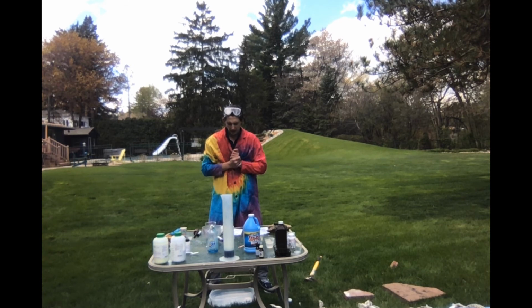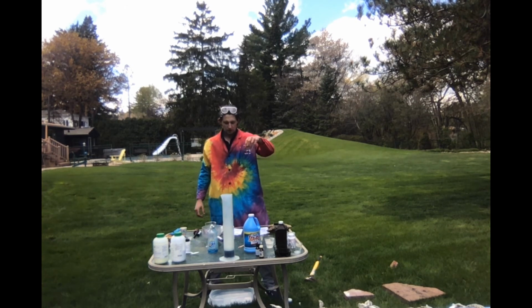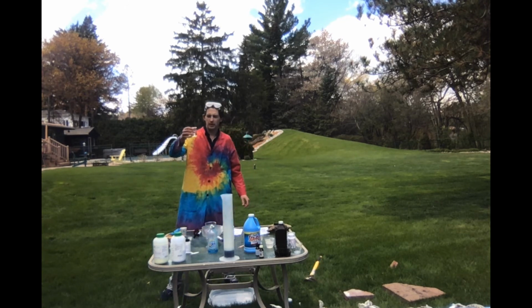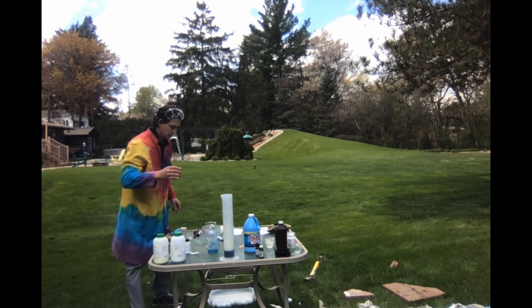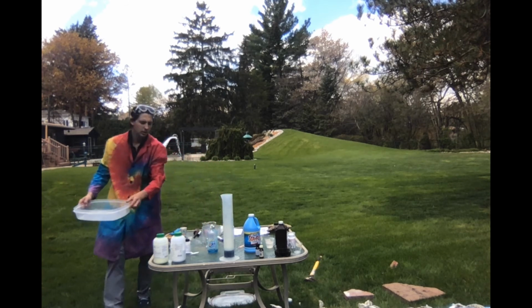Now, what we have in this one is 25 milliliters of water and about 5 grams or so of potassium iodide, all right? So I'm going to simply add this into here, and we are gonna see what is happening, all right? We don't need the water anymore.